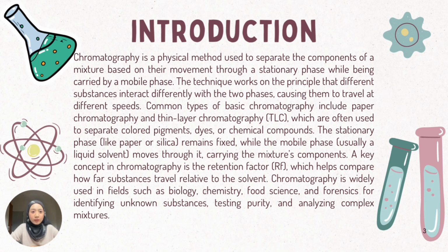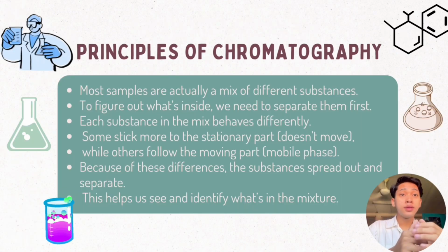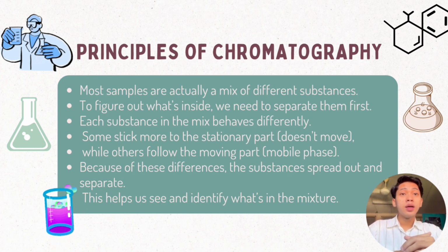to the solvent. Chromatography is widely used in fields such as biology, chemistry, food science, and forensics for identifying unknown substances, testing purity, and analyzing complex mixtures. Now let's take a look at the principles of chromatography.